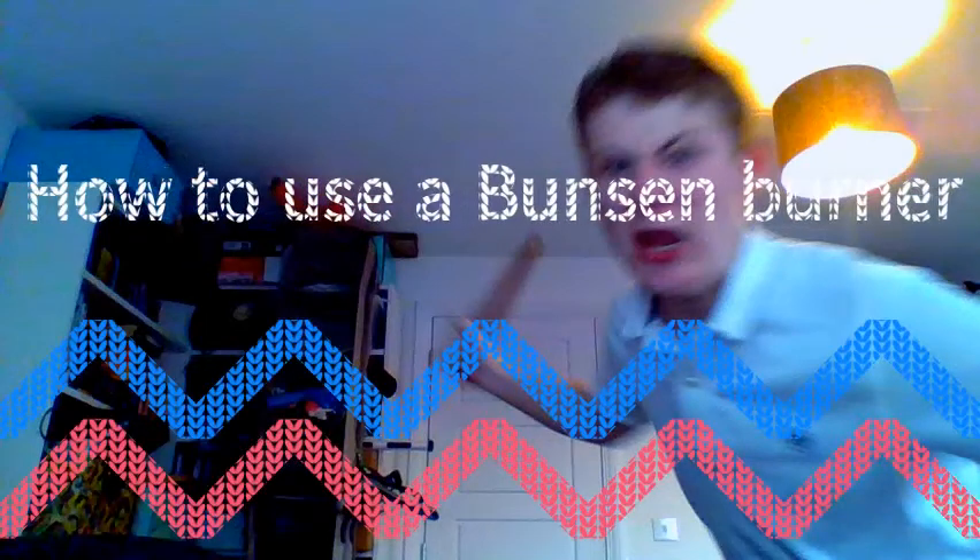Hello there. Hey guys, it's Crow, back with another video, and today I'm going to be showing you how to use a Bunsen burner. Let's just jump right into it.